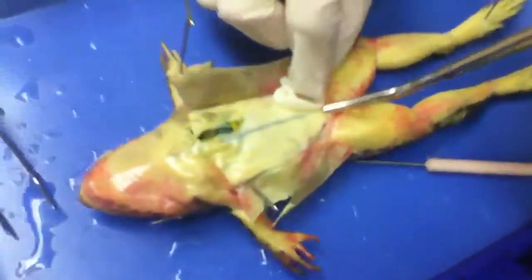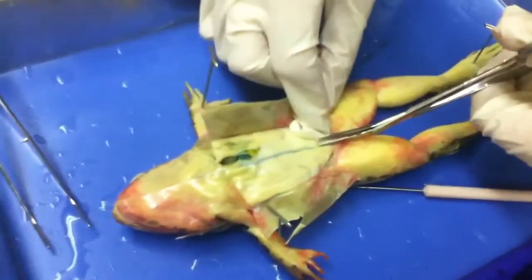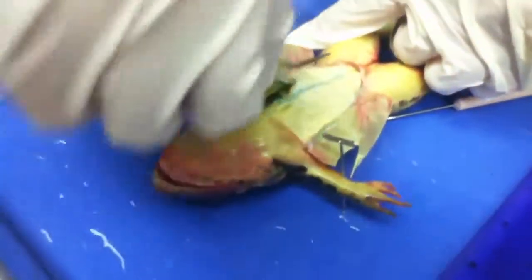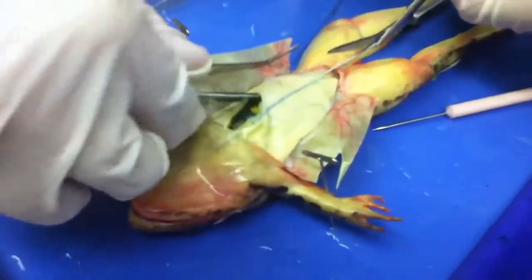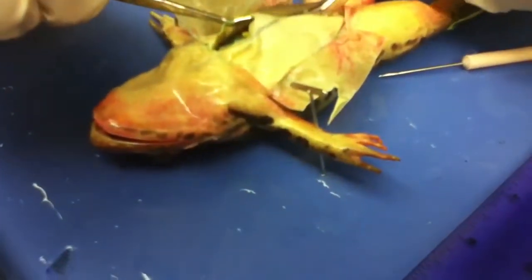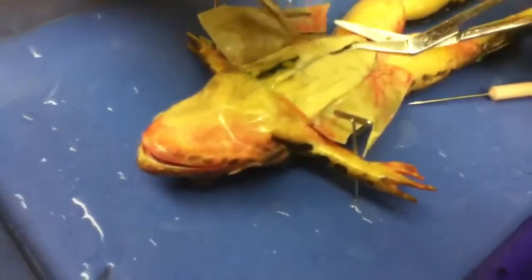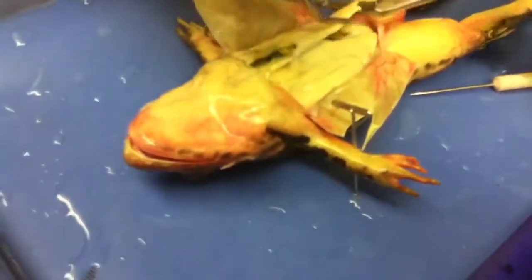Okay, everybody listen for just a minute as you're doing this. The tighter you pin your frog, the easier it is to access the organs. Oh, this shows us how to do it. Pin it down really well. Just a minute, I'm cutting mine open. Don't distract me. Yeah, just cut the sides here. You're doing it right.